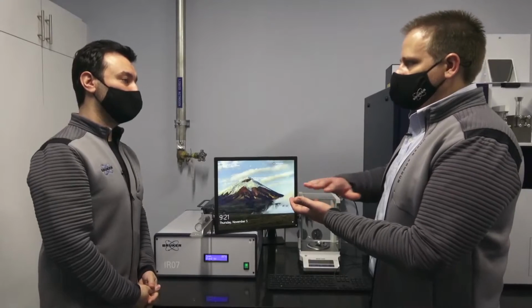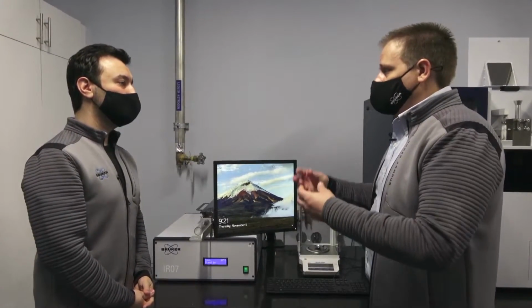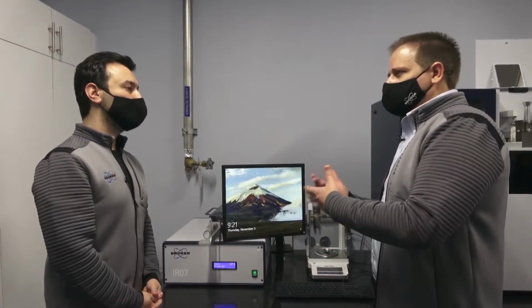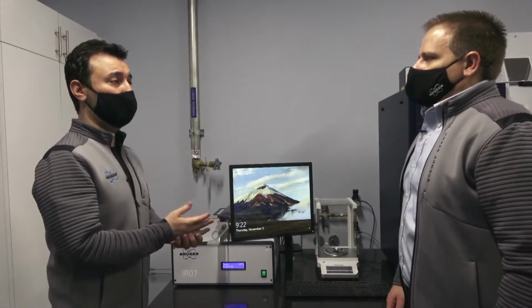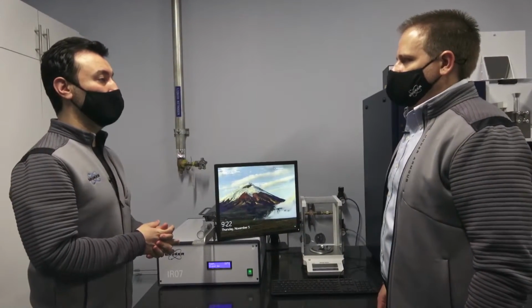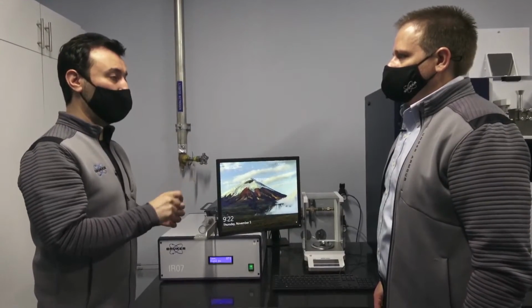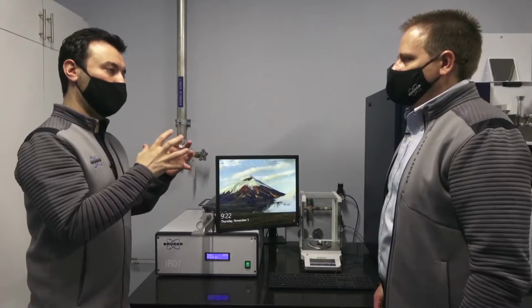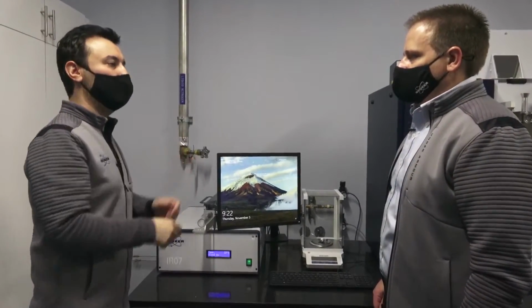Okay, and so my understanding then is when I'm welding, I'm going to try to use a blanket gas in order to protect that weld, but sometimes some hydrogen gets incorporated too. Yes. And some of it is in the form of H2, which is more stable, or it can be in the stable hydride form, but you will also have some diffusible hydrogen, definitely. And if you want to analyze that welding seam later on, just after the welding you can put it in liquid nitrogen and freeze it, and that's how you store the diffusible hydrogen inside your material, and then you take it out and put it in the machine.